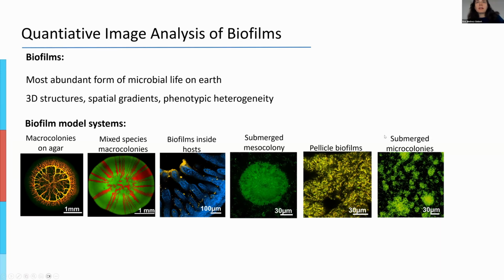And as you can see from this, in our lab, we are interested in analyzing this heterogeneity using tools and developing new tools. One of the tools that we like to use for that is image analysis. As you can see from this diversity, it is very difficult to really capture all of this diversity with one single analysis pipeline. That is why in our lab we use custom software with MATLAB. And we had a lot of different scripts that we kept changing a little bit for every single new phenomenon that we wanted to analyze.